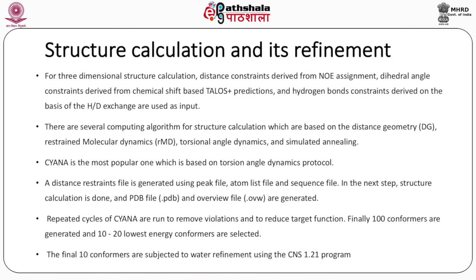Structure calculation and its refinement. For three-dimensional structure calculation, distance constraints derived from NOE assignment, dihedral angle constraints derived from chemical shift based TALOS Plus predictions, and hydrogen bond constraints derived on the basis of HD exchange are used as input.